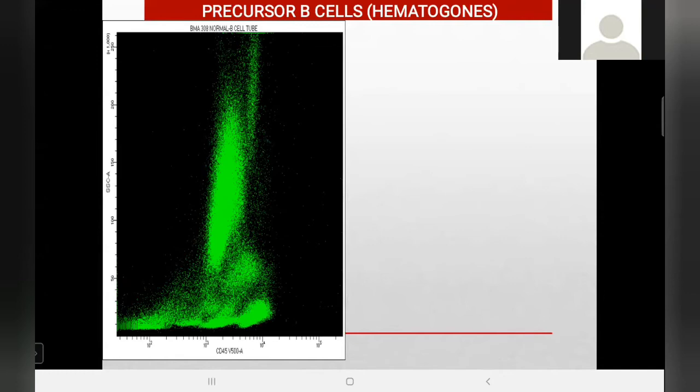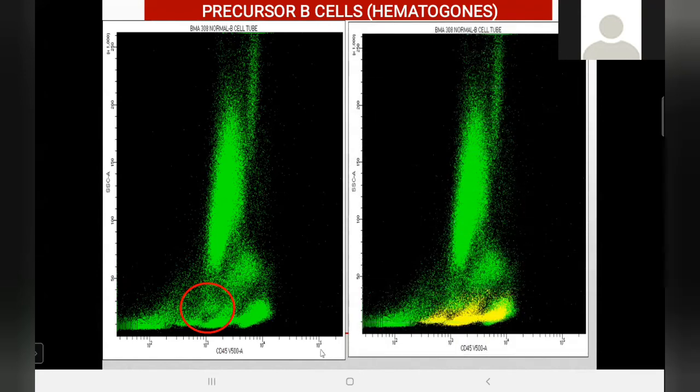So I want to show you the positions of these normal cells before we go on to the abnormal one. So this is the position of the normal myeloid blast. Now let's have a look at this case. Now this is again the extreme right population on the CD45, which we will call lymphocytes. This population is the granulocytic population. Now again we put the same gate here. What do we see? There is something which I will highlight in this picture, which is coming out of the progenitor gate, but it is in the dim 45 region. And can somebody tell me what are these? Ma'am, they can be normal or abnormal blast. Abnormal. Perfect. So normal or abnormal blast, all right. Okay, anybody else? Okay, so your answer is right. They can be normal, they can be abnormal.